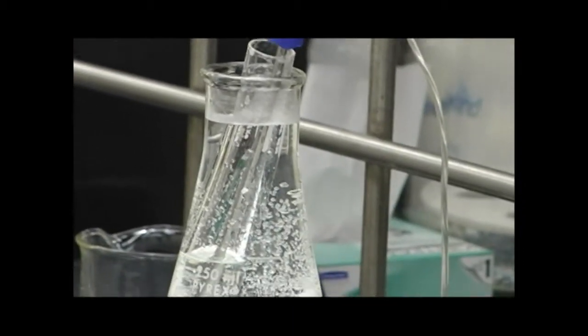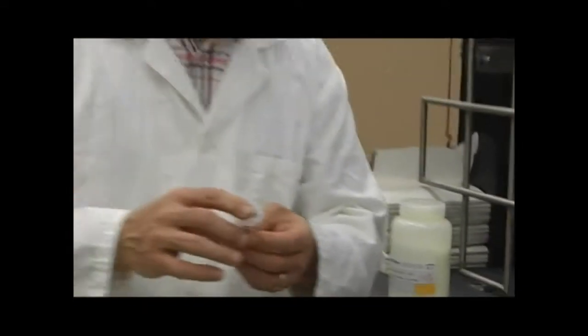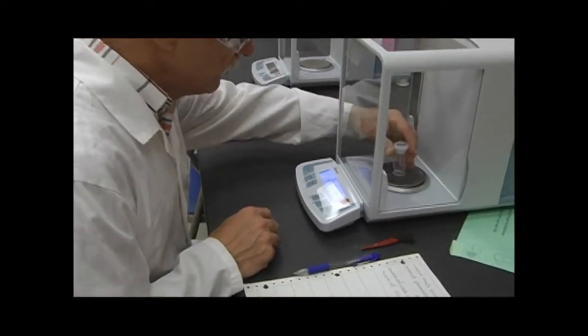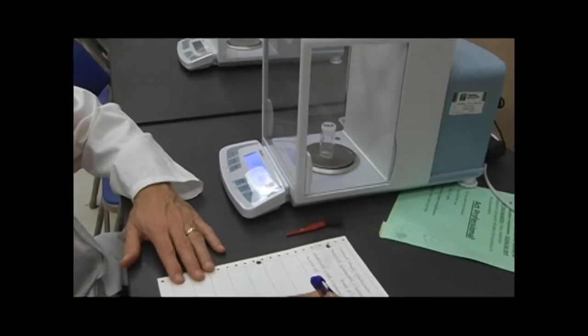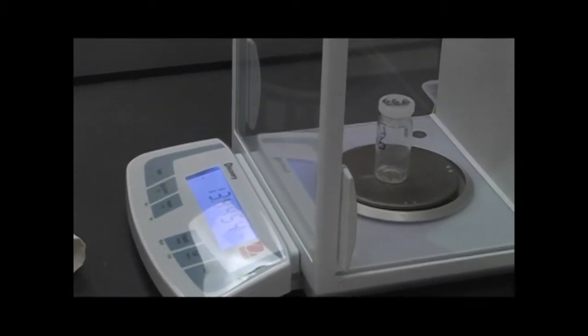We'll go weigh the vial so that we know how much unknown we have entered into the test tube with the lauric acid. So we have our empty vial. We're going to record the amount, and then we'll do our subtraction to determine the amount of unknown that is in with the pure lauric acid.